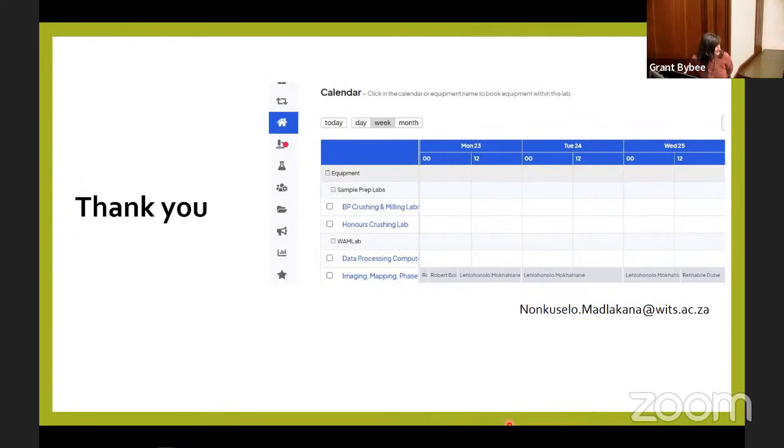Please, Sharad. Can you tell us which elements cannot be analyzed using this? Something like lithium, the light elements, like lithium, beryllium, and all of those things cannot be analyzed, right? Most of the elements can be analyzed, but of course the lighter ones cannot. And some of the heavy ones just take a lot of time because there's overlapping.